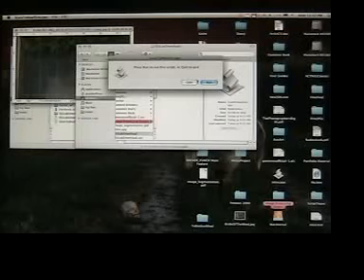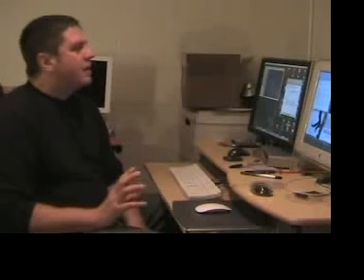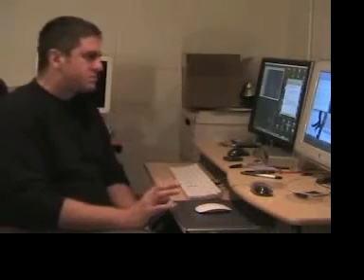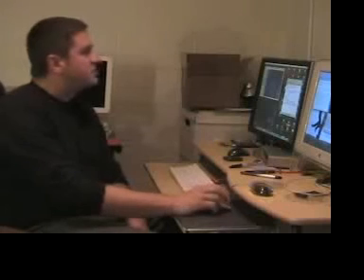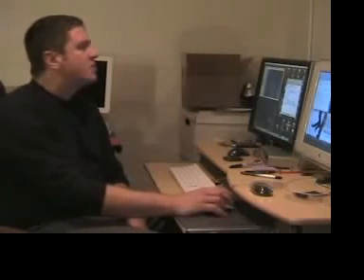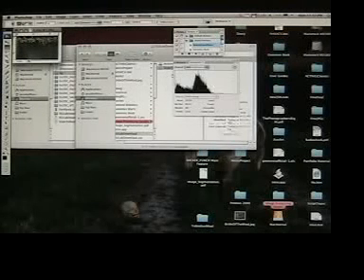So you can just press Run, or after a short delay, you'll get a dialog box that pops up, and it'll ask if you're happy with your selection. If you've got a good square selected, if you're happy that you've selected a dead-on square reference in your image, hit OK or Return, and doing so will automatically resize your image and select all of the green pixels.